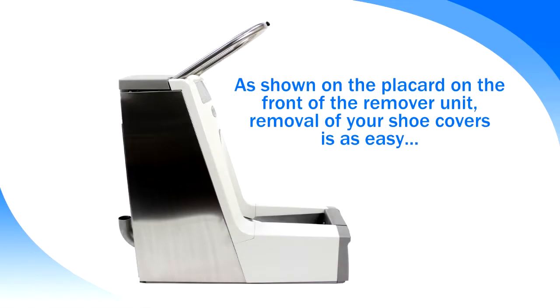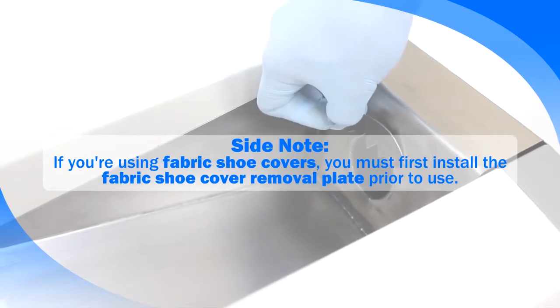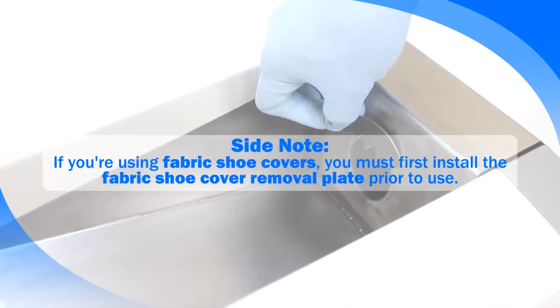As shown on the placard on the front of the remover unit, removal of your shoe covers is as easy as 1, 2, 3. Side note: if you are using fabric shoe covers, you must first install the fabric shoe cover removal plate prior to use.